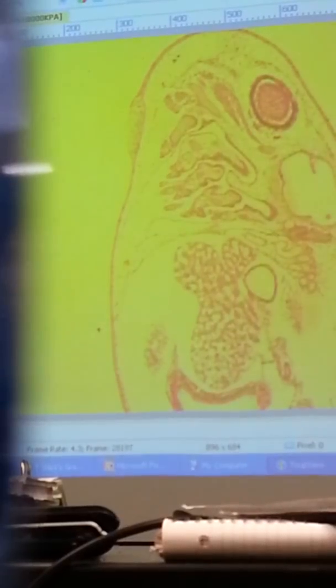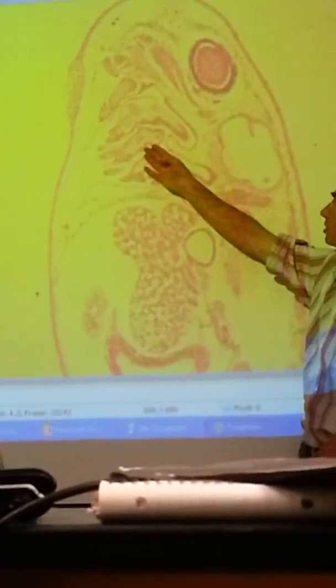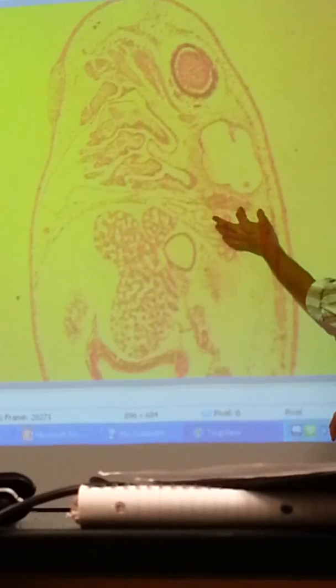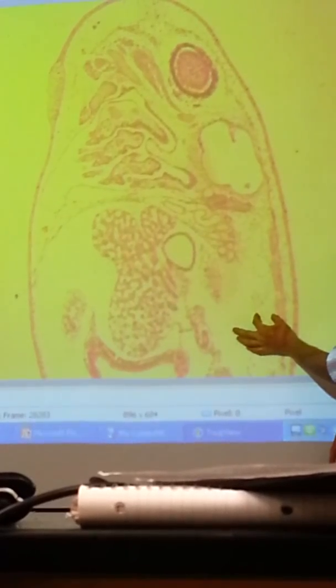I want to go back to this one here. This is more out toward an edge. You know that because you're seeing an eye, you're seeing pharyngeal gill slits. You're seeing something else tucked up against the back. Remember, here's notochord, that's kind of that clear zone.